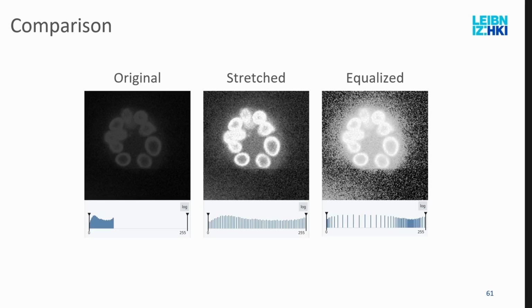And then I tried it here out in ImageJ or with JIPipe. This original image, you still see here how it ends at this 68. If I just stretch the histogram, just stretch the values, then it looks like that. Then if I do histogram equalization that tries to make it uniform, it looks like that.